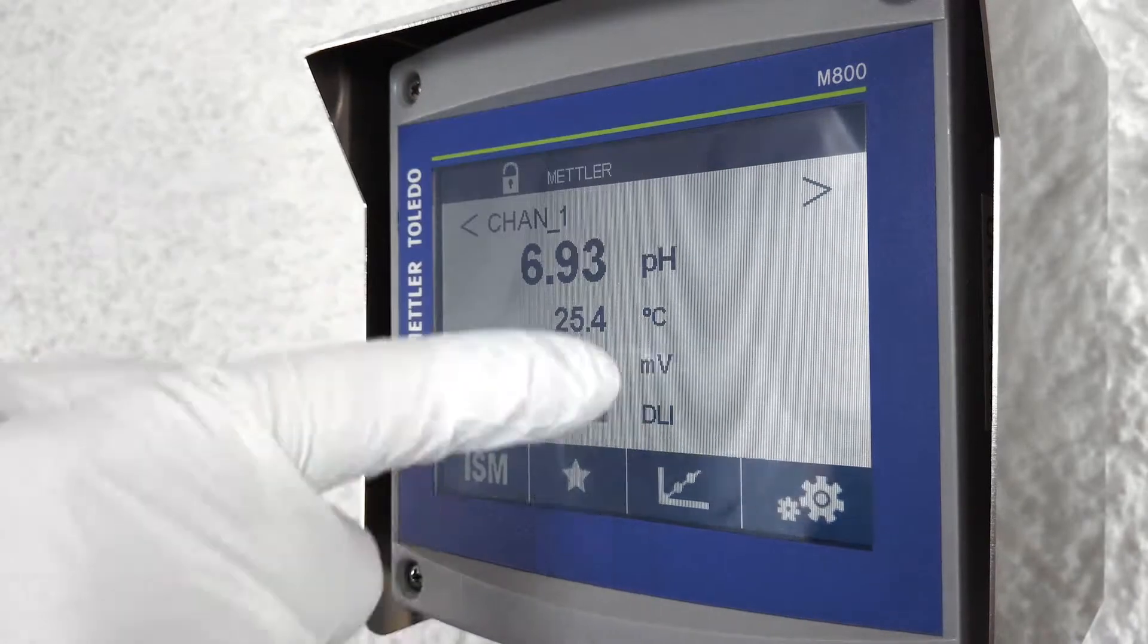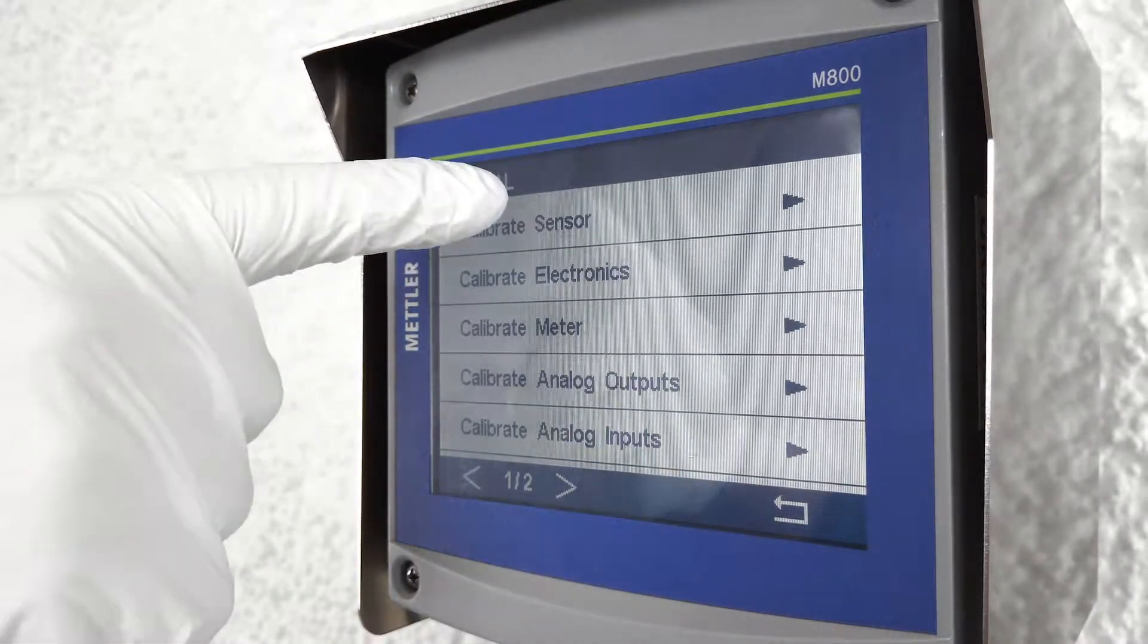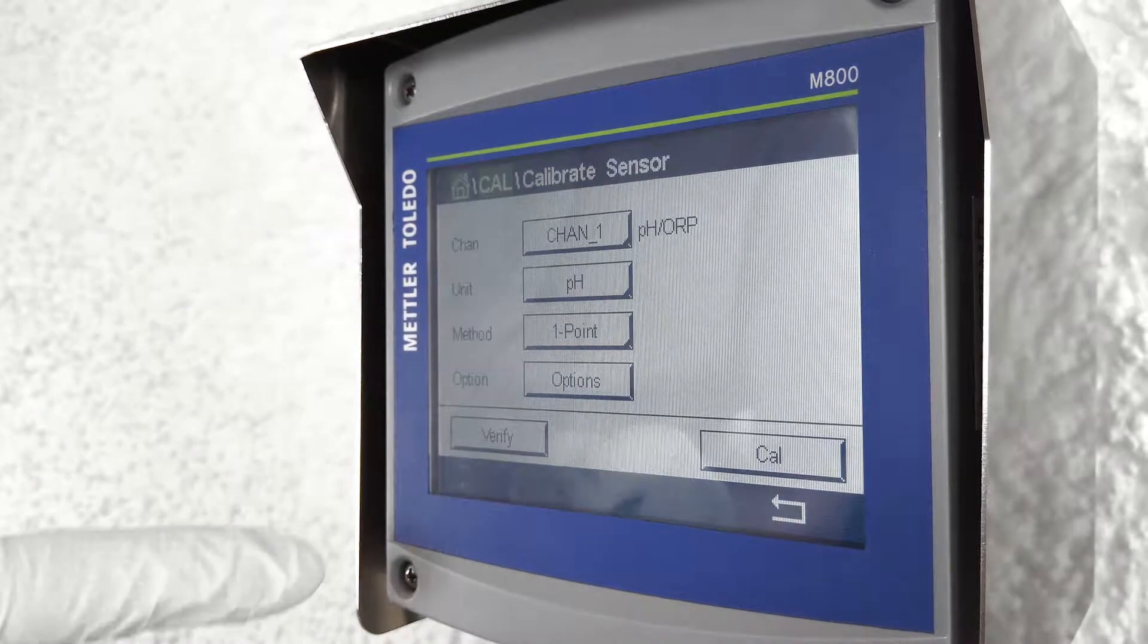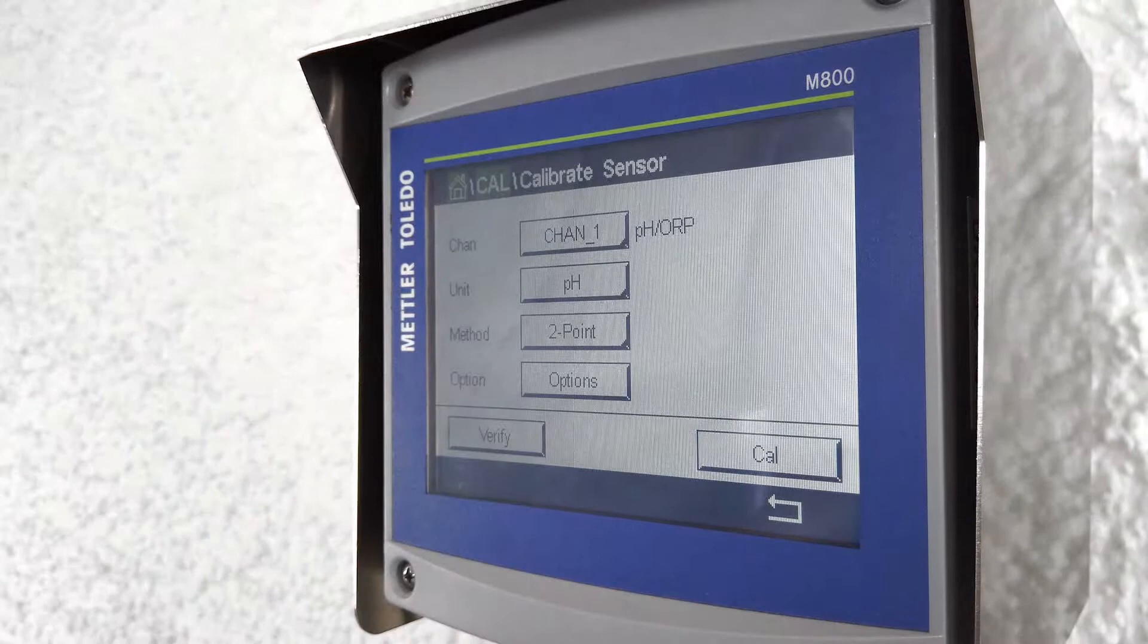On the transmitter select the calibration menu by clicking on the calibration button. Since this is a two-point calibration, click on method, select two-point, and press the calibration button.